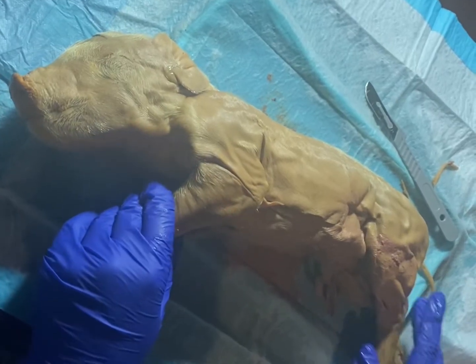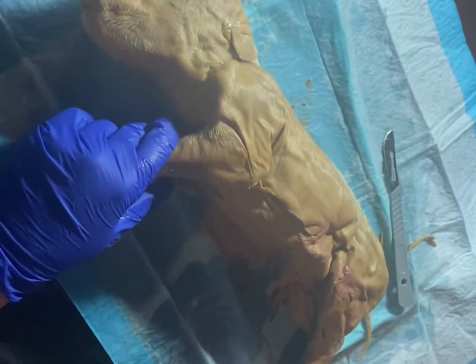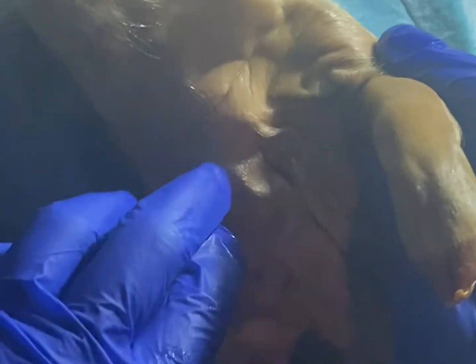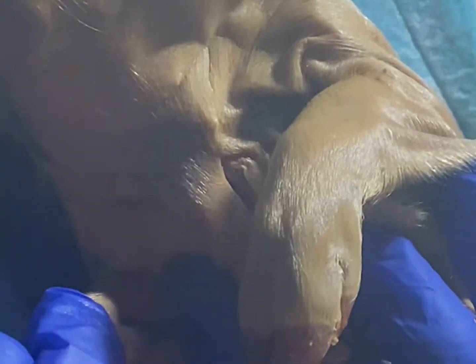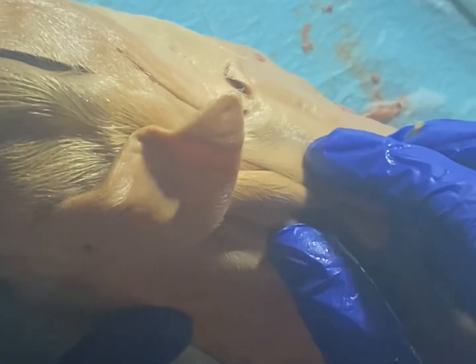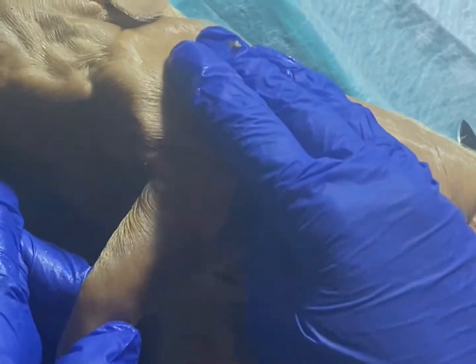Okay, so the next system that we are going to be working with is the muscular system of the pig. The first term is the pectoralis major, which is his pec muscles, and they're located right here on your pig. We have the latissimus dorsi, which is located on the back of the pig along here. And the deltoids on the lateral aspect of the pig.